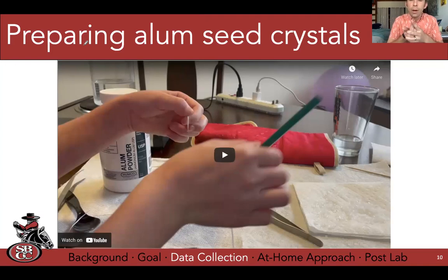And I'm going to talk about some other options that we have for doing that more efficiently. But I want to just kind of give this. These are the operations as the instructions really say, with the exception of I'm not using a hot water bath. I'm just keeping my hot water hot on a hot plate and slowly adding it. So it's at 100 C, and I'm adding 100 C as quickly as I can.